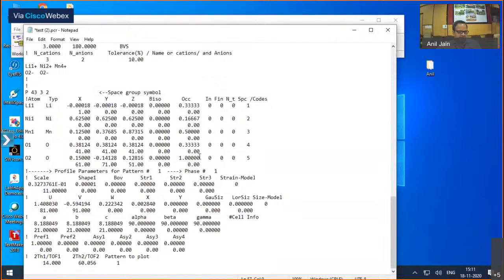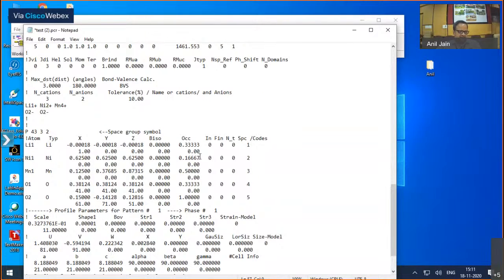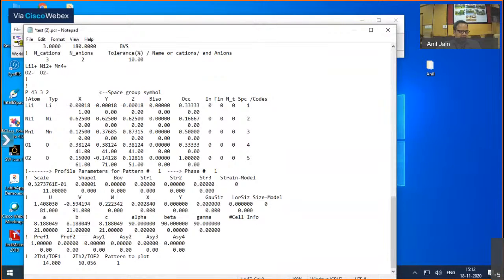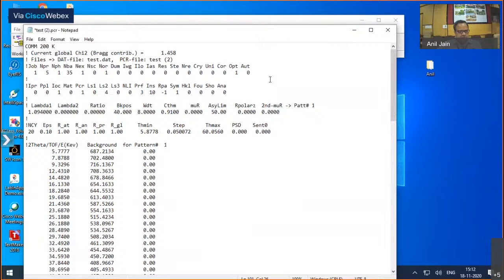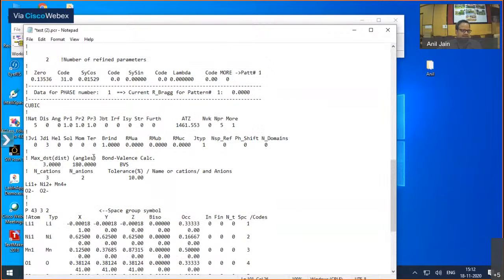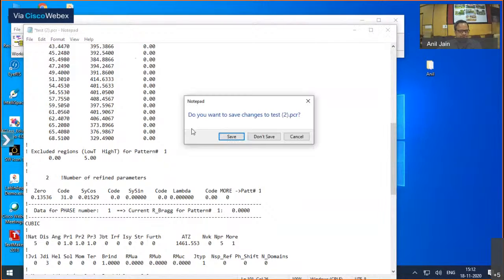But here sometimes you get an error, and most of the time the reason is this: if you are working in auto 0 mode and you do not define any parameter like 21 and directly come to 31, and let's try this experiment now, then the program is supposed to give an error. So I am running in auto 0, the manual mode, and I have not given any code word 21 for the refinement. Let us see what it does now.